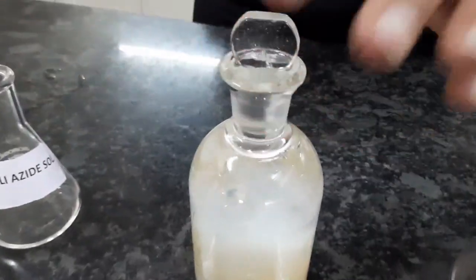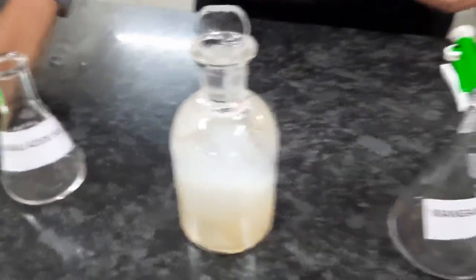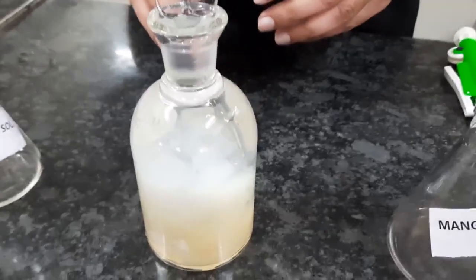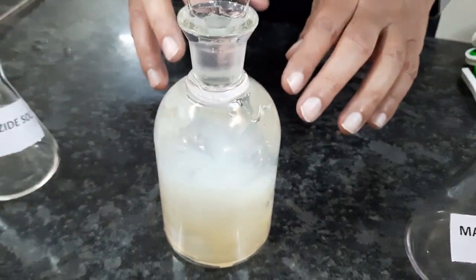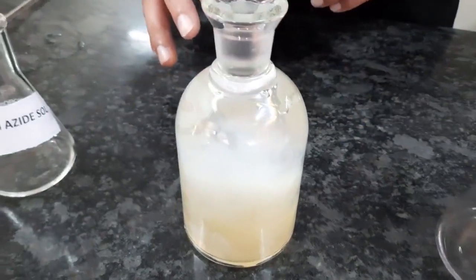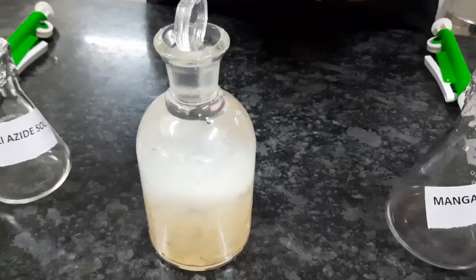Stopper it, and allow this precipitate to settle down in the dark, or it can be kept as it is, and see that the precipitate settles down to half of the BOD bottle, and then the next acidification procedure can be carried out.